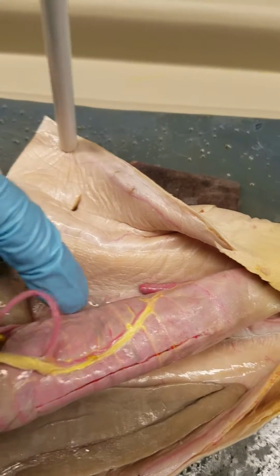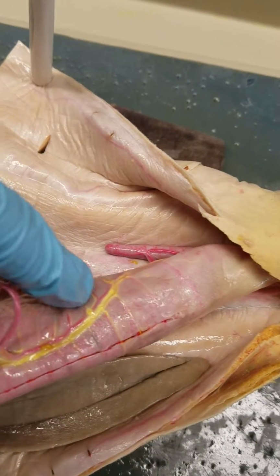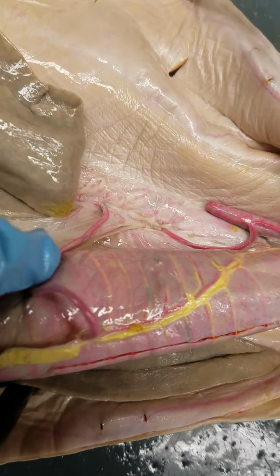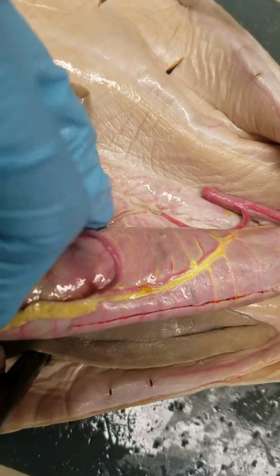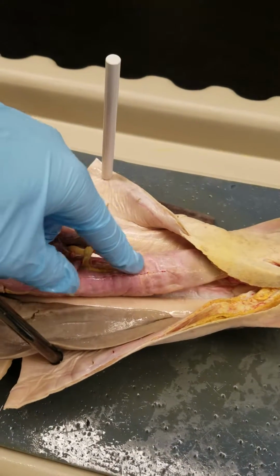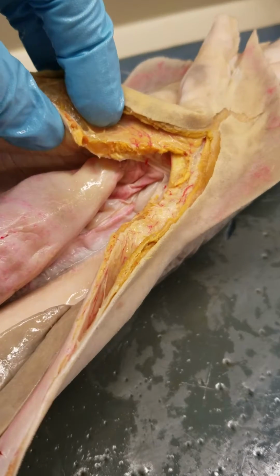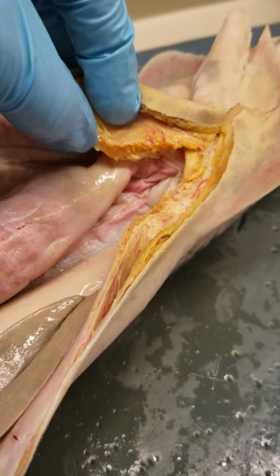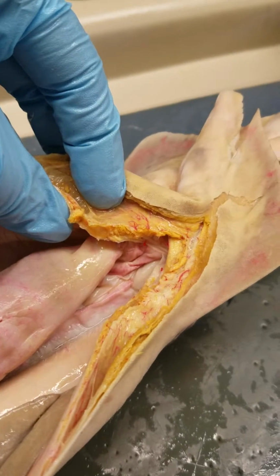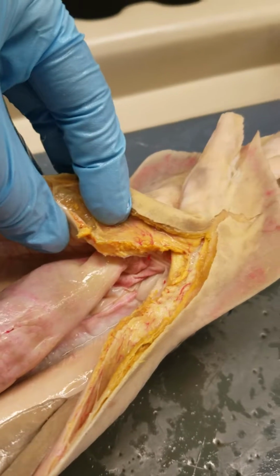On here you can see your posterior mesenteric artery, and then moving this way it kind of loops and goes anterior mesenteric artery. You got your valvular intestine here. And moving down, you can kind of see this piece of cartilage here, which is your pubosciatic bar. I probably butchered that.